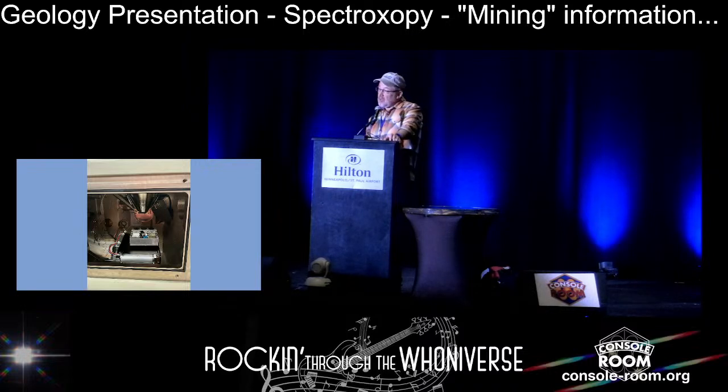But they built this holder for us, not knowing that we were getting the wavelength dispersive spectrometer. There's one of the positions we can't use. I know you can't see it real well from that, but we can put 3 thin sections and 3 round holders in there that usually hold standards. Right now we have a thin section in there, and then there's a little round stud that doesn't typically go on this holder, but I put it in there because I know the position that I can stop it at.